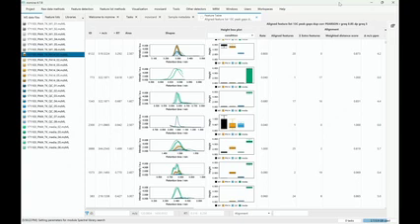There's a little bit, yeah. Maybe Steffen actually wants to take over. I'm currently building something like that. I'll give you my email and then I can send you a test version. Currently it's not in this version, but it's something that we can work out.